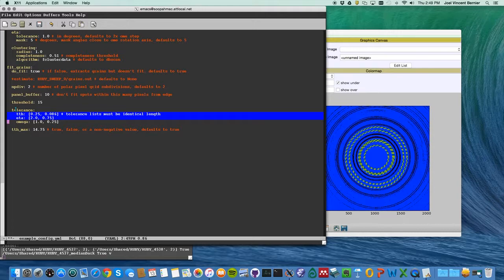So in this first tolerance fit, 0.25 degrees in 2 theta, which is huge, 2 degrees in eta, and then effectively 2 degrees in omega because it's plus or minus 1 degree. So this would be plus or minus 4 frames around the reference or calculated angular value that the spot should be in. Of course, you can move these around, and the local pixel size gives the discretization in 2 theta and eta on an image. Omega's discretization is based on the step size used in measuring each frame.